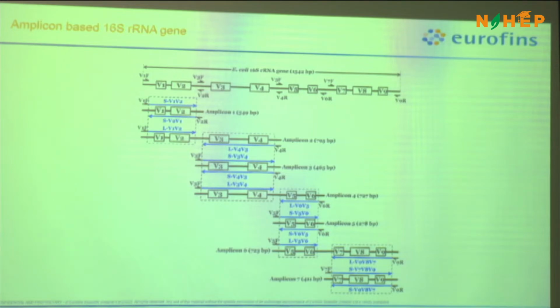Here, we are again making our search criteria very small. We are just taking the V3, V4 region. When we are doing long read technology, we take the entire gene to sequence it. The resolution of your identification will increase with long read technology.